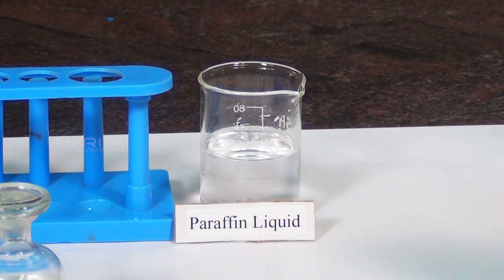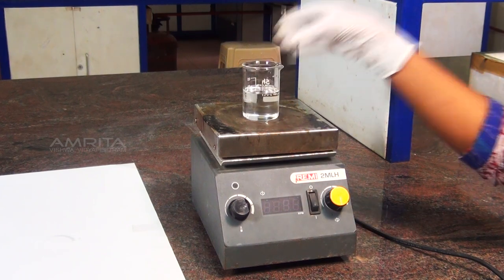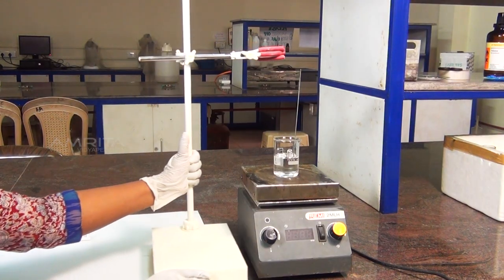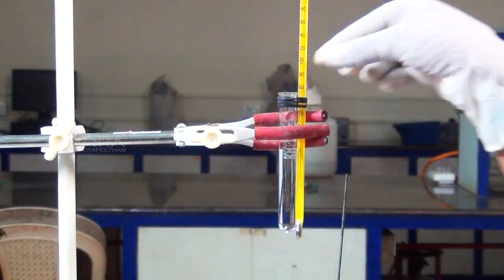Take the 100ml beaker half filled with liquid paraffin and place it over the hot plate. Now place the stand near the hot plate and clamp the thermometer carrying the test tube to the stand.